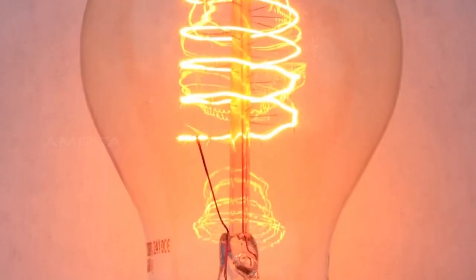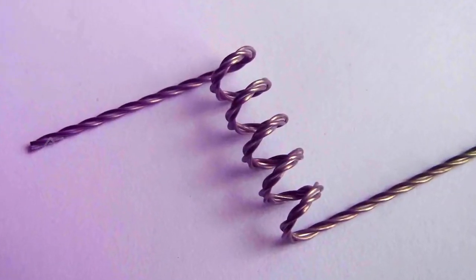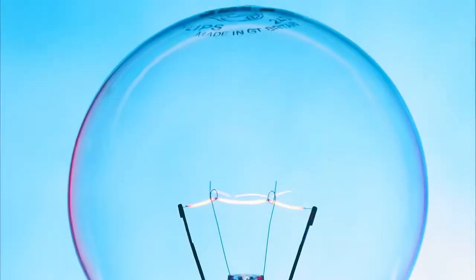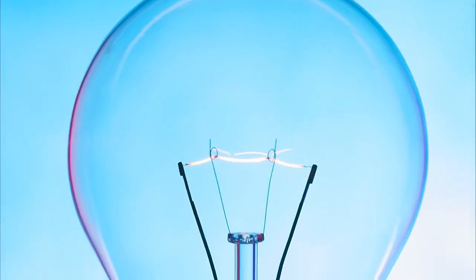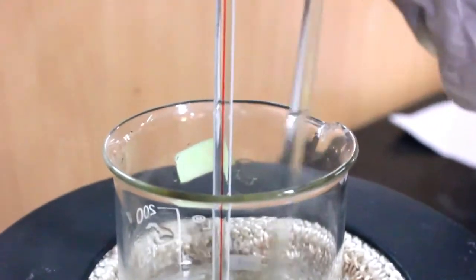The chemical element with the highest melting point is tungsten at 3410 degrees Celsius, which is used for making filaments in light bulbs. The aim of this experiment is to determine the melting point of ice.